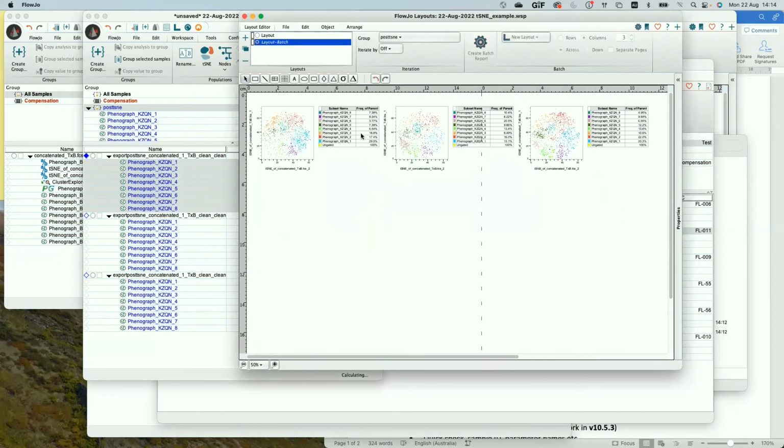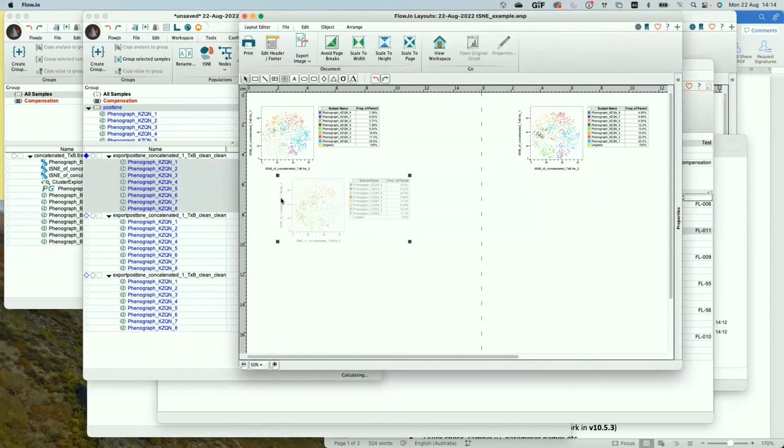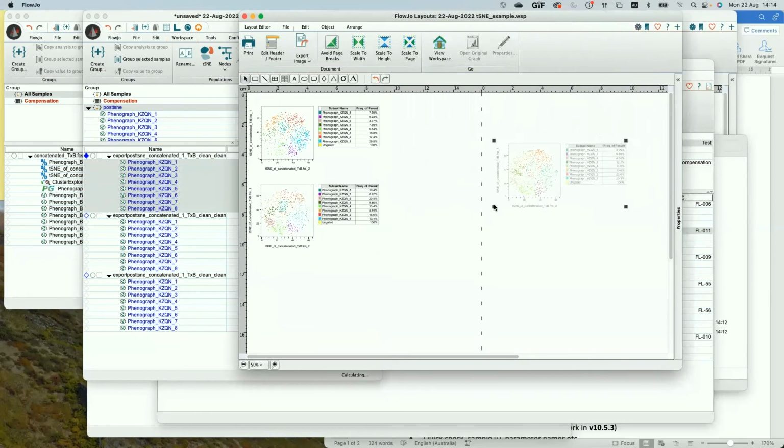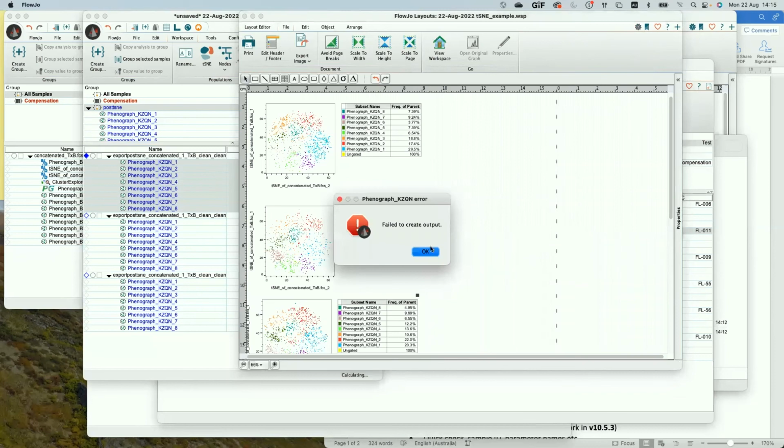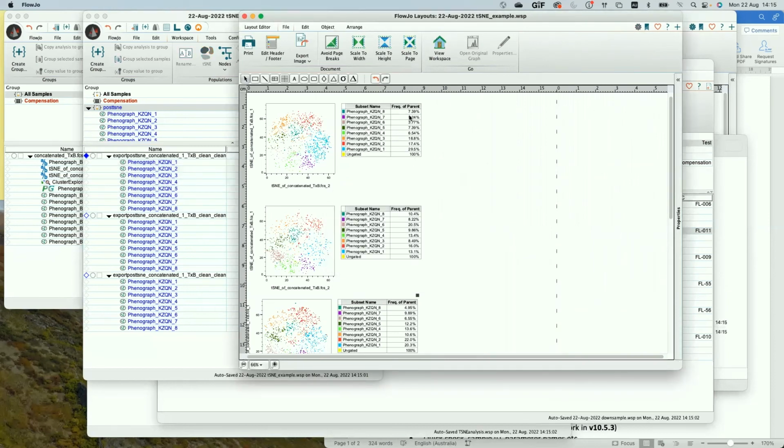You're going to do a batch for your post tSNE, and that's your healthy, that's your Crohn's, and that's your colitis. And so you can now have a quick look down everywhere and look at your changes in your percentages and figure out which one of these clustered populations may be of interest.